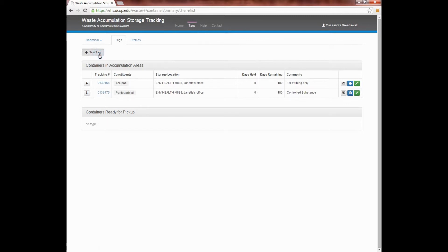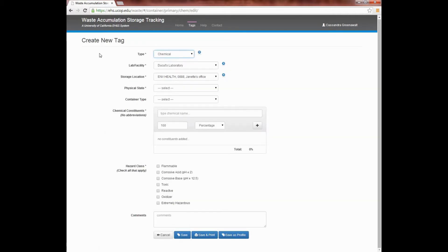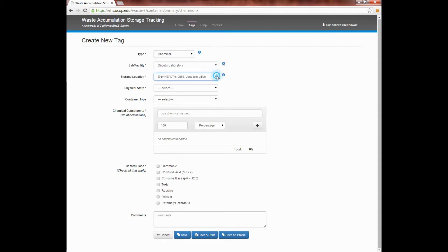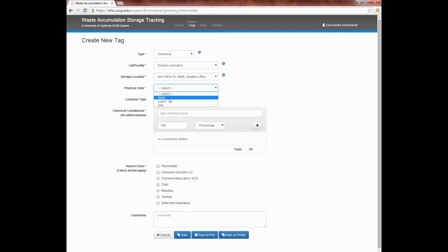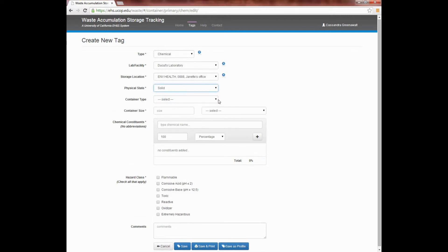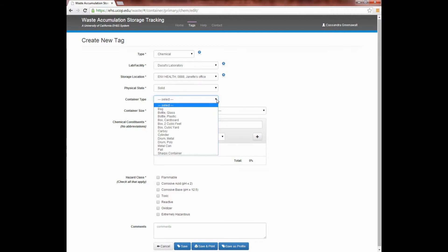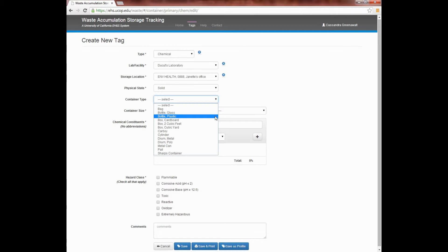Select the type of waste you're generating, the laboratory or facility, and the storage location of the building and room you're working in. Then select whether your waste is a solid, liquid, or gas under physical state. Then choose your container type, identifying whether it's a bag, bottle, box, carboy, cylinder, drum, can, pail, or sharps container.